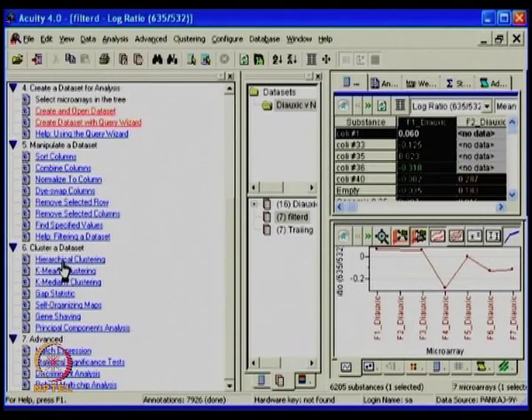And once you do have the results, an idea, you can cut down, because hierarchical is a little RAM consuming. It takes a little bit more time, because you can imagine all has to be linked to one. And there are different ways of doing it: centroid based, the Pearson correlation coefficient based or distance metric based, and lastly binary based. Okay. So binary based is usually used for only CGH kind of analysis where it is present-absent type, whereas the earlier two are extensively used in the microarray data.